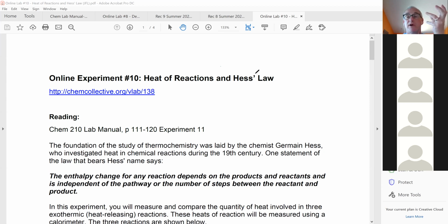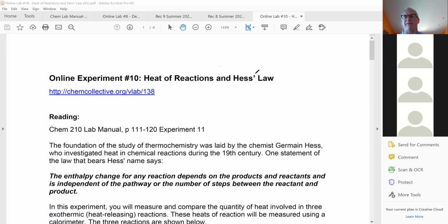The one we're going to do today is not exactly the same as the one we were going to do in the lab. The one in the lab involved weak acids and strong acids. We're strictly doing strong acids with this one, but a lot of the lessons learned will be the same. So I want you to read that through and do the pre-lab questions. We're going to call them post-lab questions, and have that included with your report.